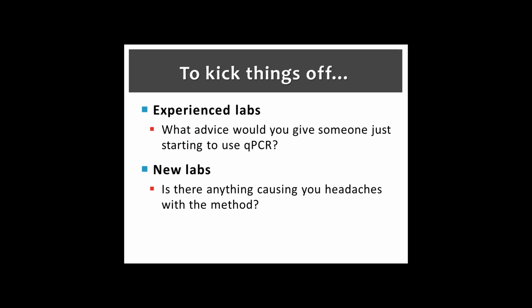Right. So the situation is this. Fortunately, in Michigan, most of our beaches, the E. coli results are less than 10. So some of our new labs have been filtering and freezing samples, and we kind of already know with the QPCR results where they're very low. So now we're going to go ahead and start running QPCR on all these very low E. coli samples. And this is where I probably call on Tiong and Rich to make a comment about that.